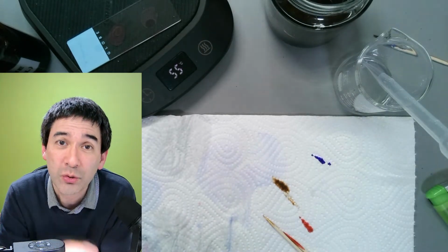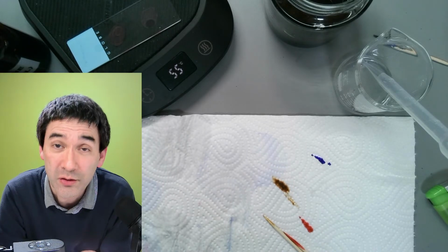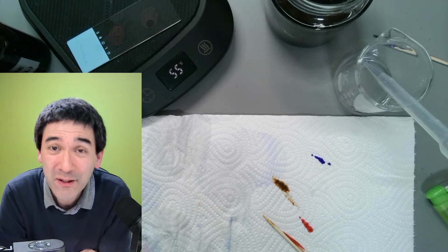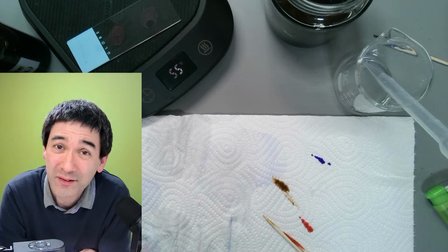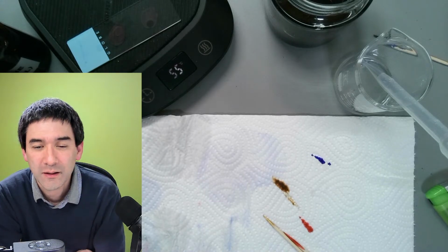If you observe that, you're able to find a lot of bacteria there, yogurt bacteria. They're Gram positive. That's perfectly fine. They're safe, but for hobby purposes you generally don't want to work with bacteria that you don't know.